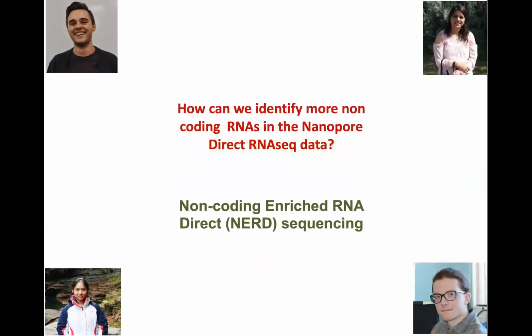And this was a question that four students in my lab have been working on during the recent years, Luke, Babita, Yubo, and Liam, and they particularly have worked on the question of how we can improve the standard direct RNA-seq protocol so that we are able to identify more non-coding RNAs that may be missed through that protocol. And with that, we have developed the non-coding enriched RNA direct sequencing, which for short I'll be referring to as NERD-seq.